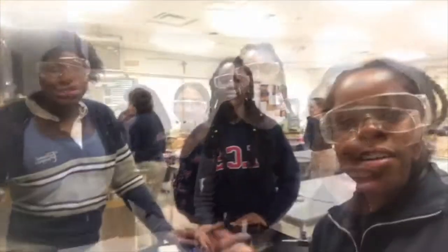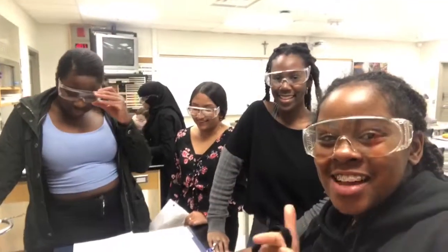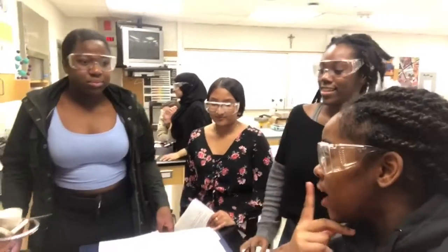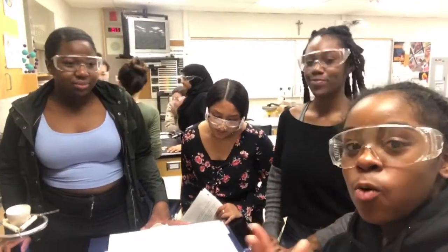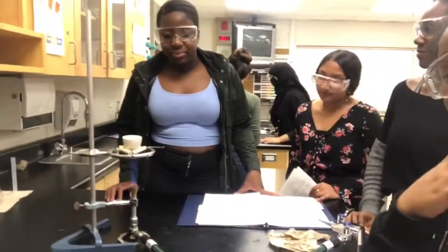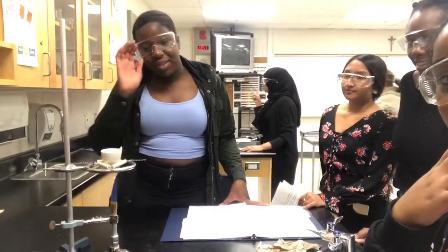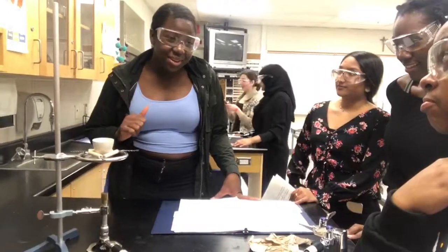Hey guys, so we're back in the science lab doing it again. This is vlog number 2. What are we looking for today, guys? The mass of a hydrate. So what do we have going on right here in front of us right now, Tashi? Tell us what's going on. We're heating a crucible to take off any moisture. So we kind of accurate.